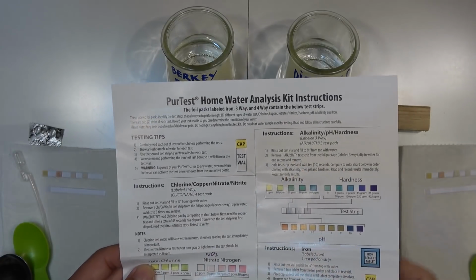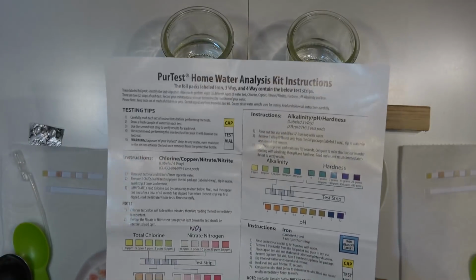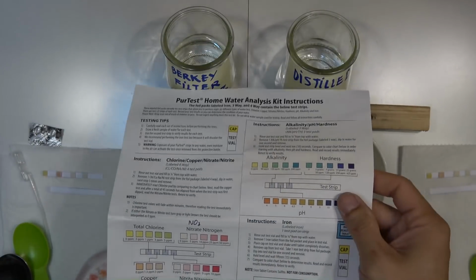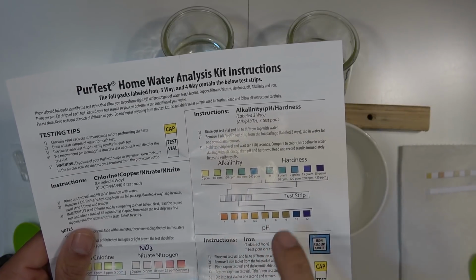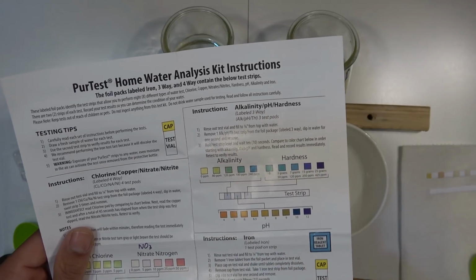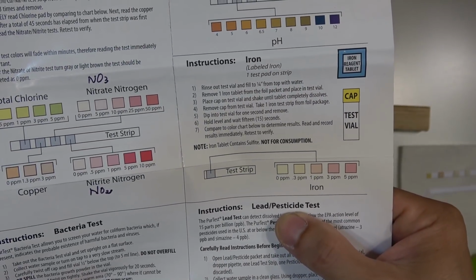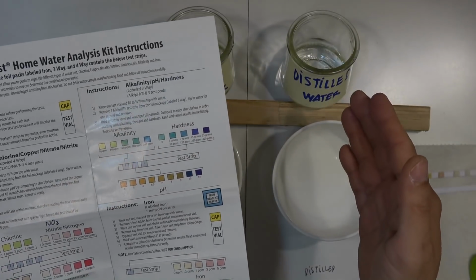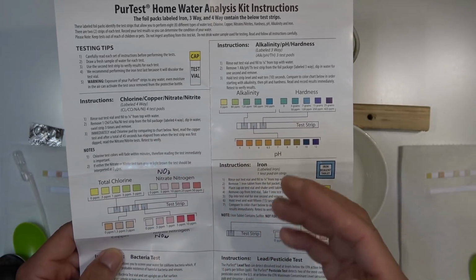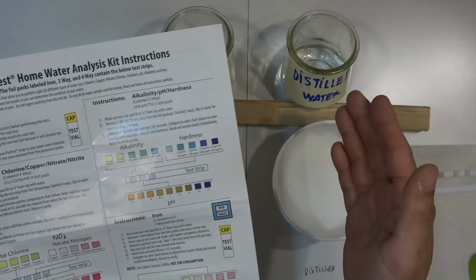So my conclusion about this test is, for the Berkey water filter, it does remove a lot of contaminants, but it is still very alkaline, still very hard, and still contains pesticide in it. Whereas the distilled water does remove everything in this test. Every single thing in this test is negative in the distilled water.